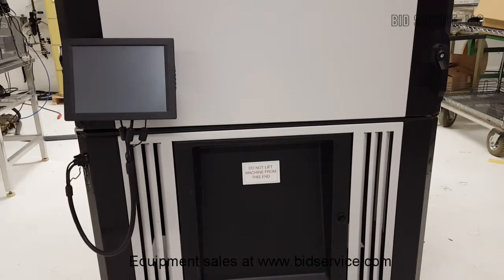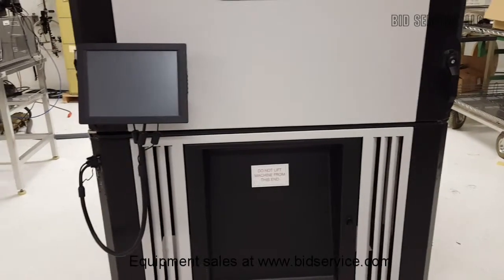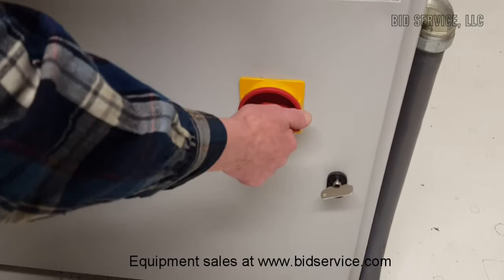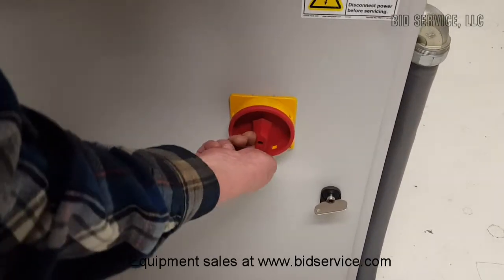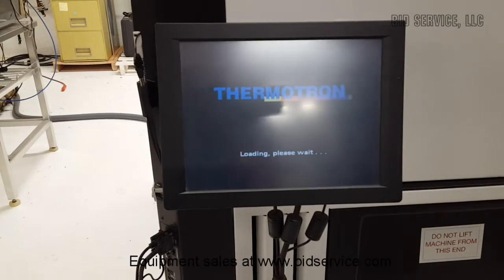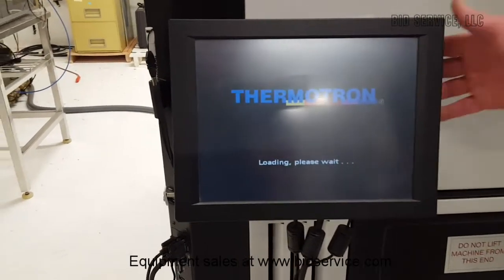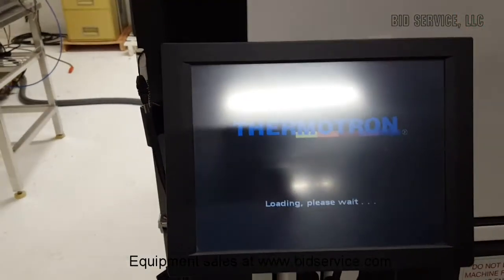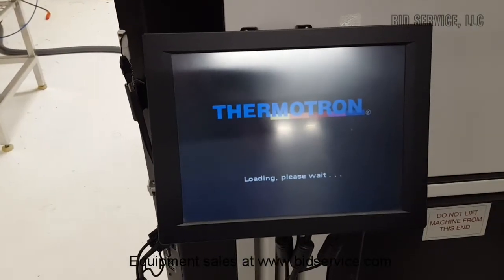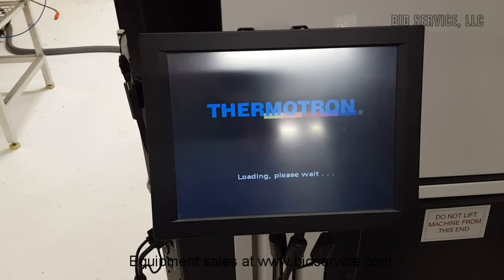First, we're going to take a walk around the back and show you the main switch. This is the main switch to turn it on. Now we'll go around to the front. We're going to wait just a couple of minutes here for it to load, go through self-test, and boot up to the main screen.